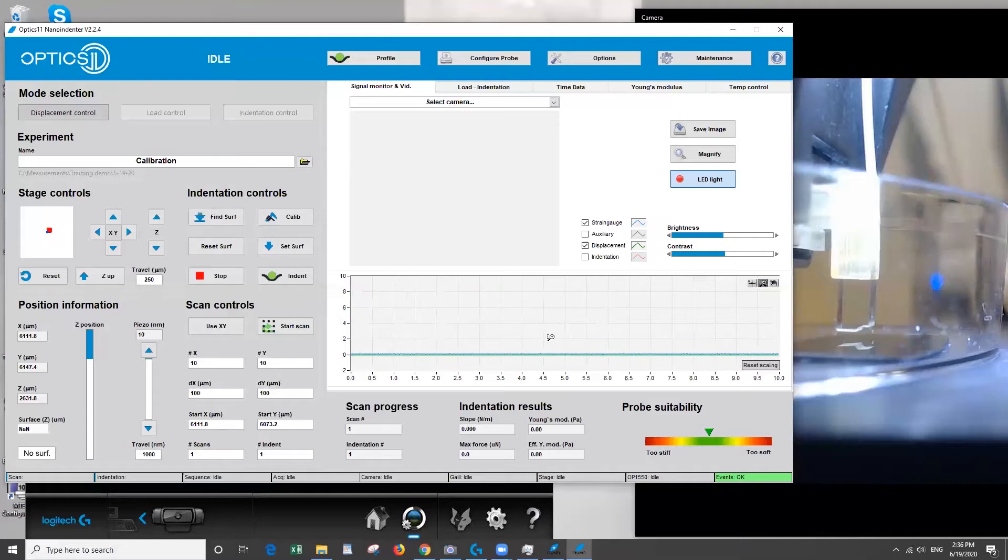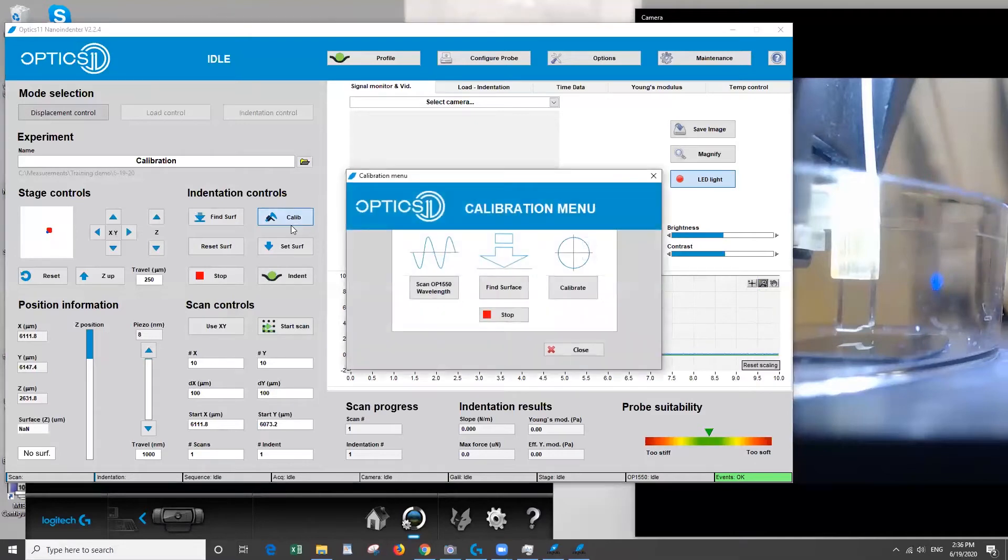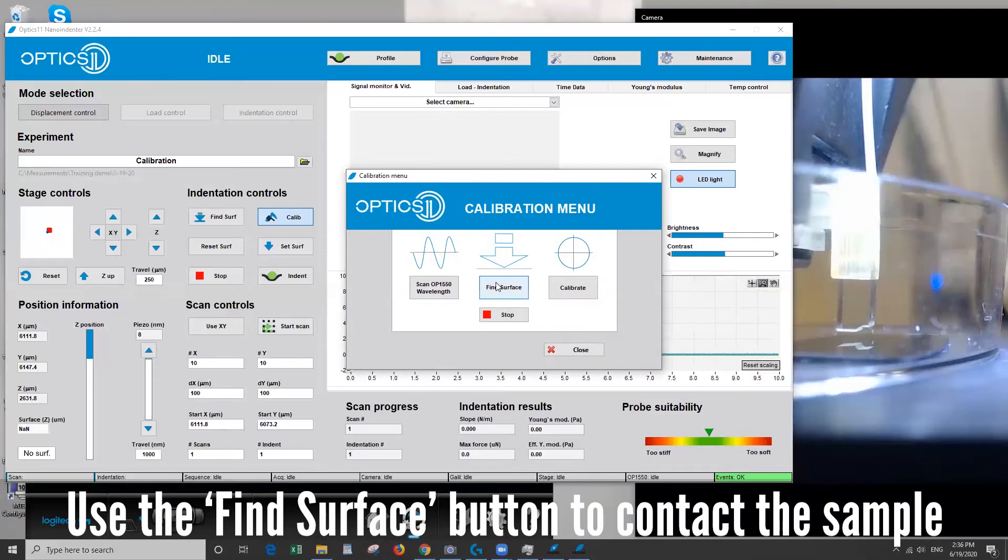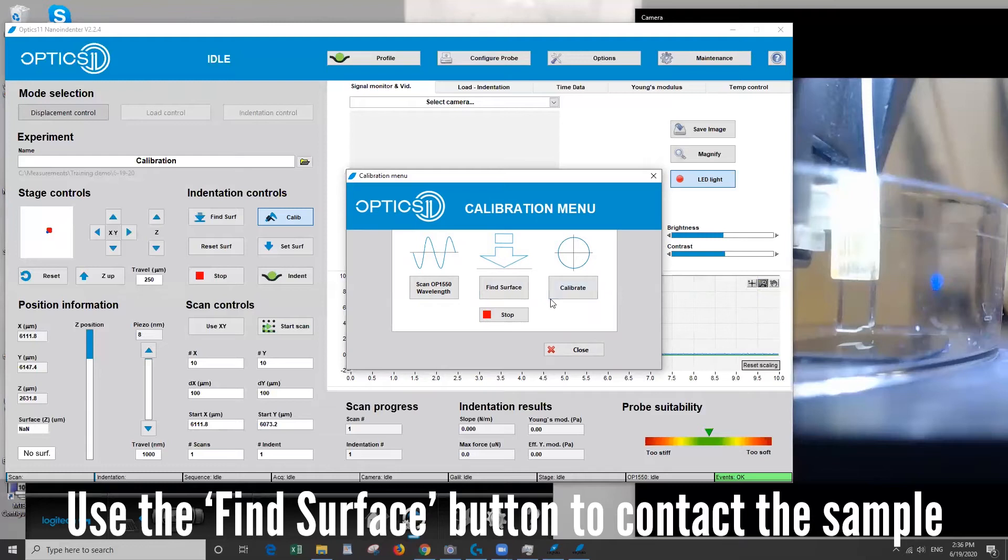So now we'll move to the next step. So we'll go back to calibration and this time we're going to use the find surface but this button does it a little different. It's actually going to approach the surface and then leave the tip in contact with the surface. And that's because we want it to be in contact when we do the actual calibration.